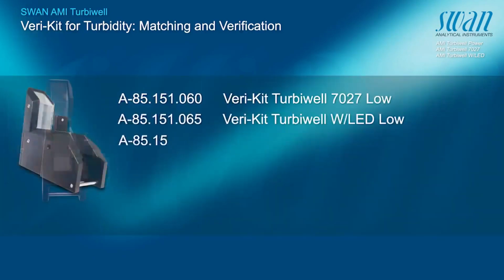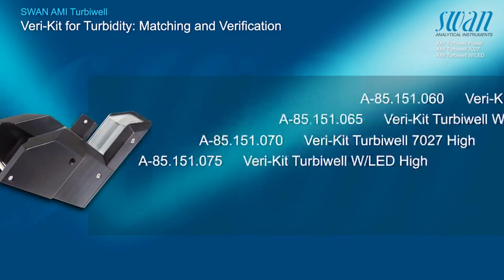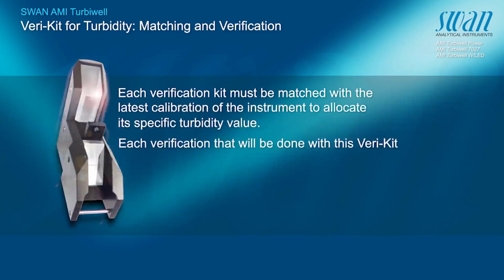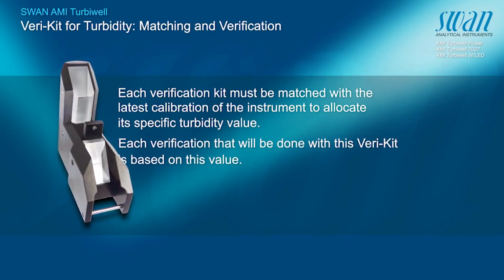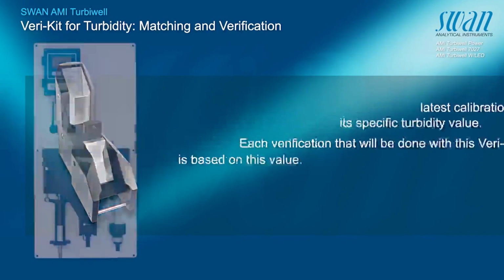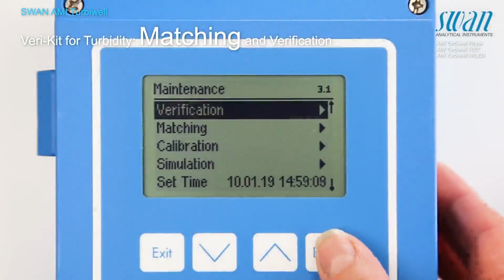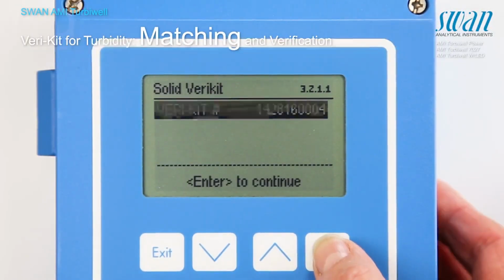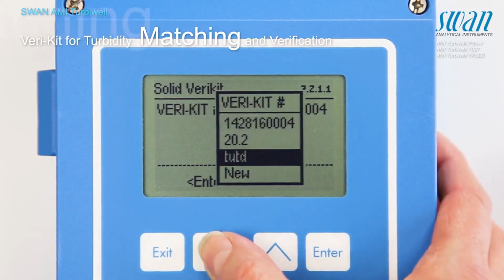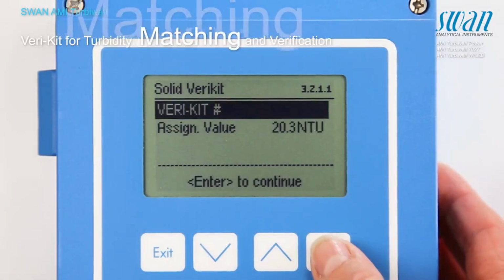The following solid verification kits are available. The matching procedure is menu guided. In case a new VeriKit is to be matched, proceed as follows.